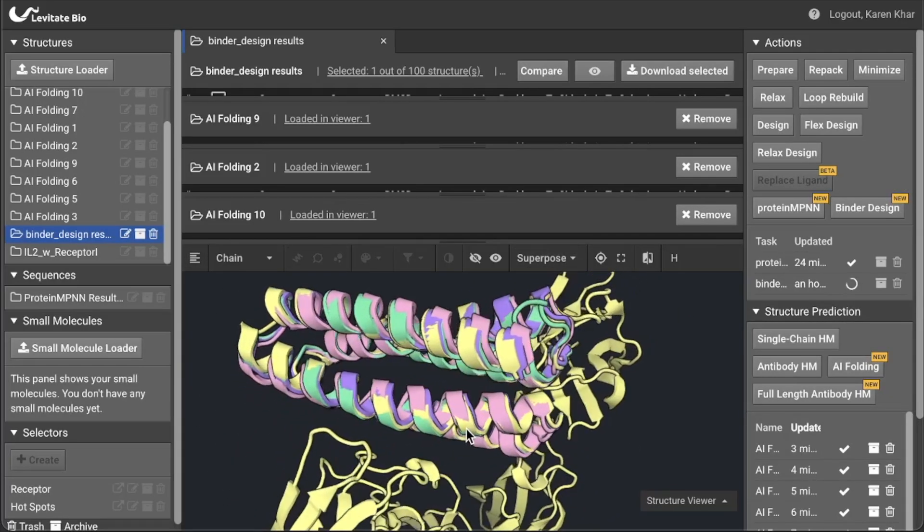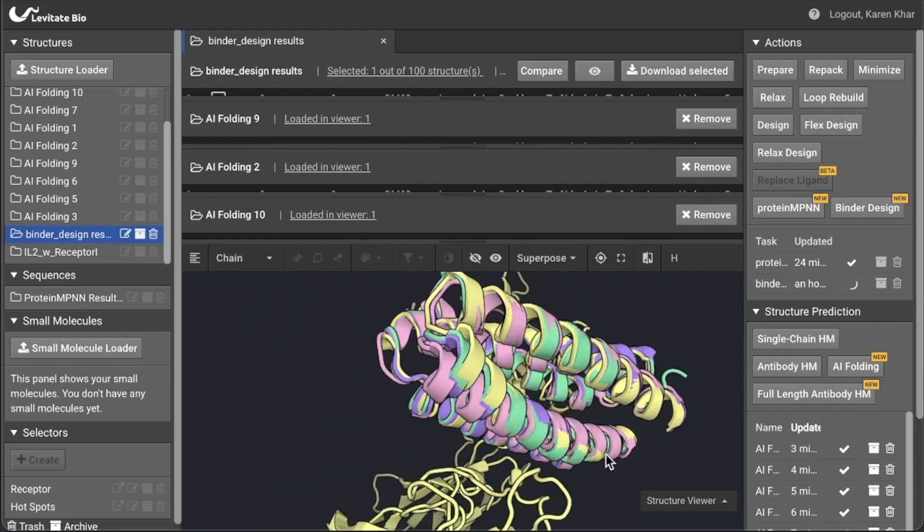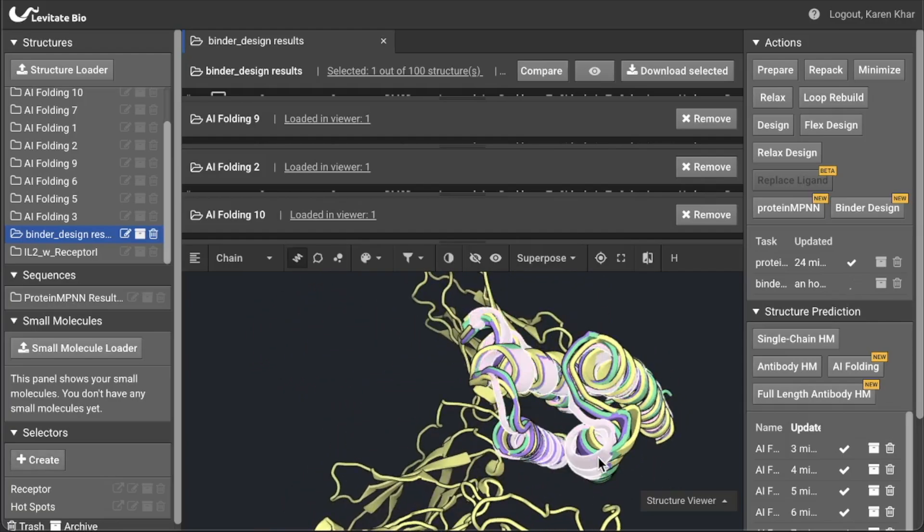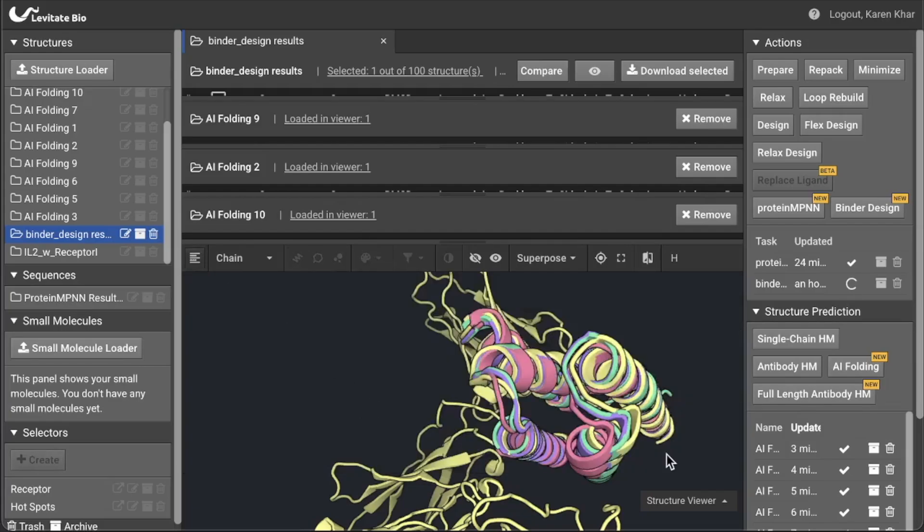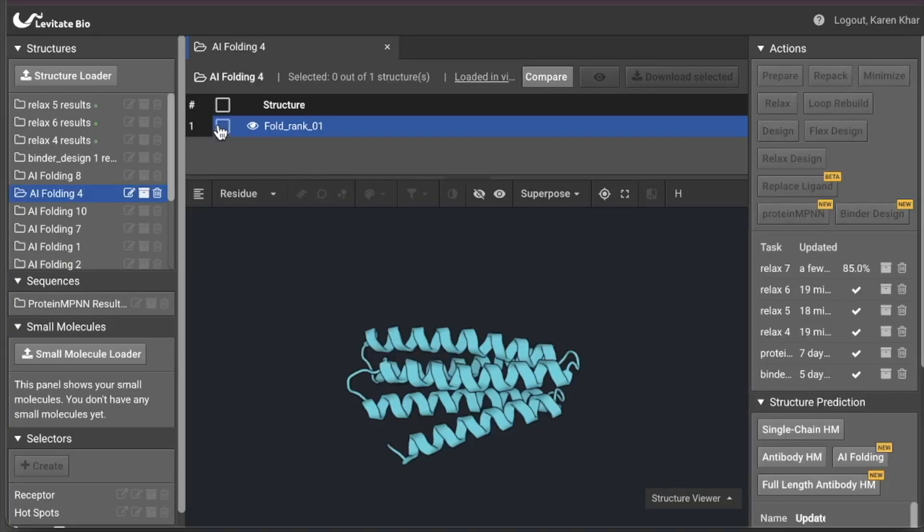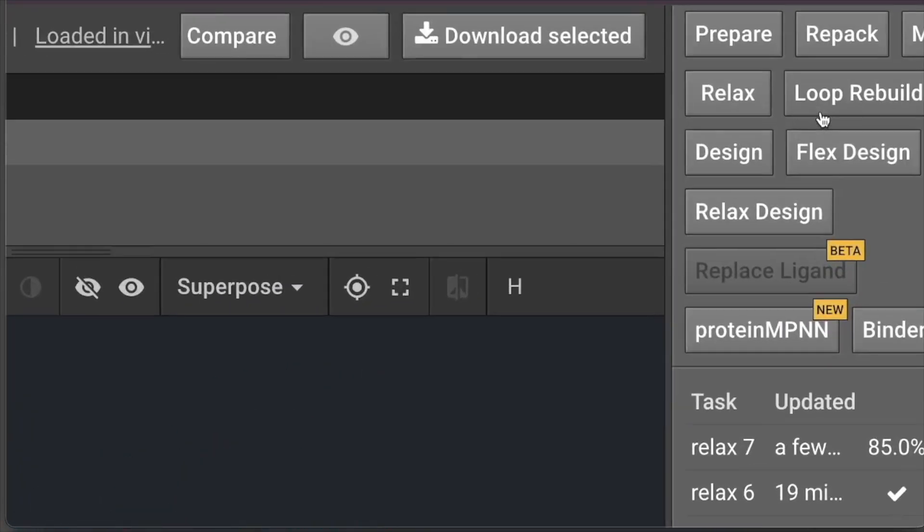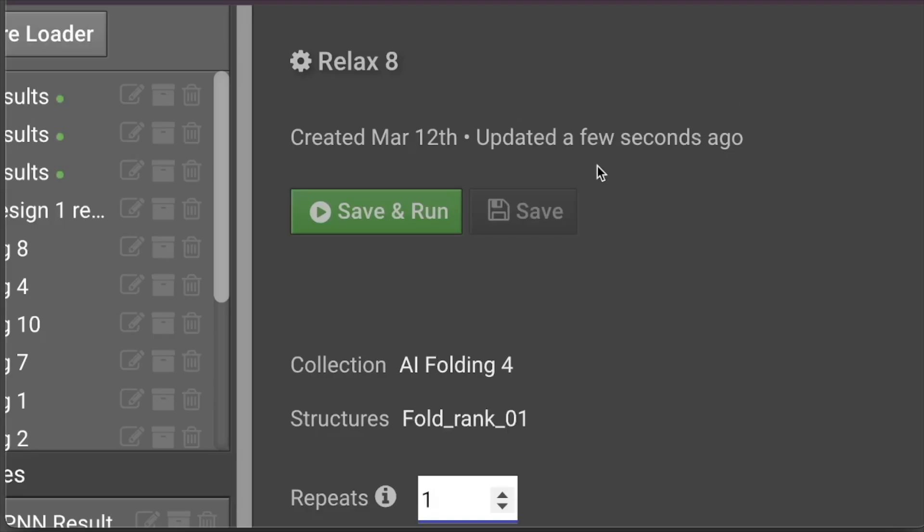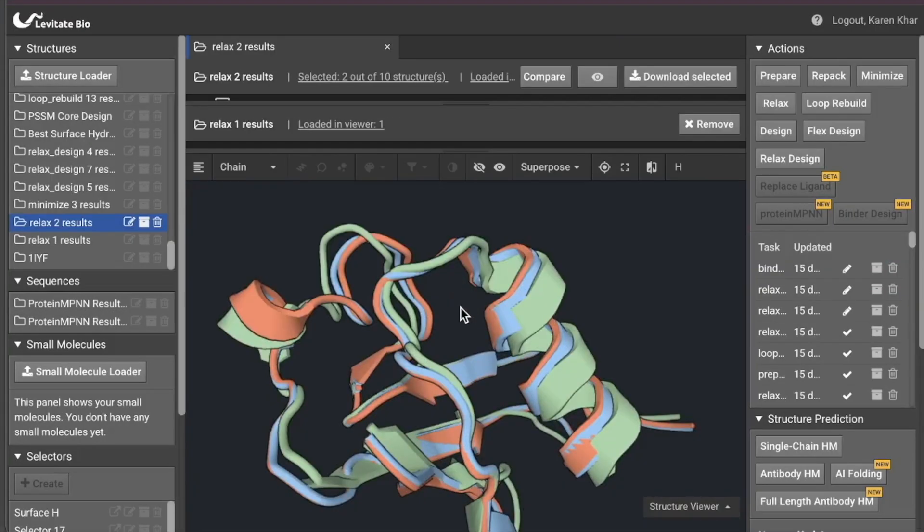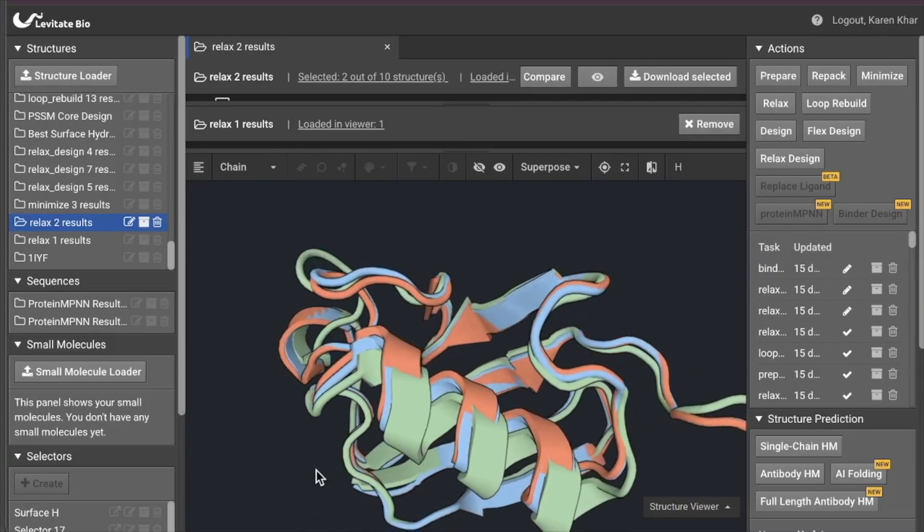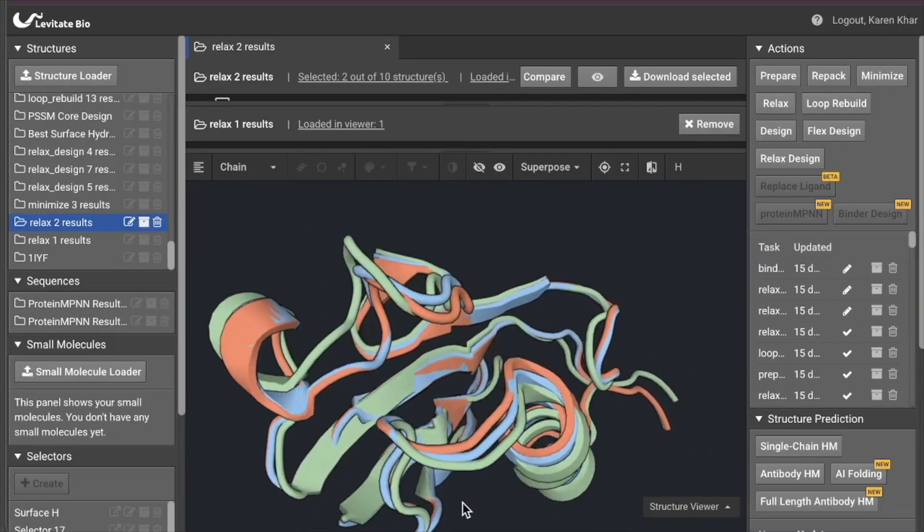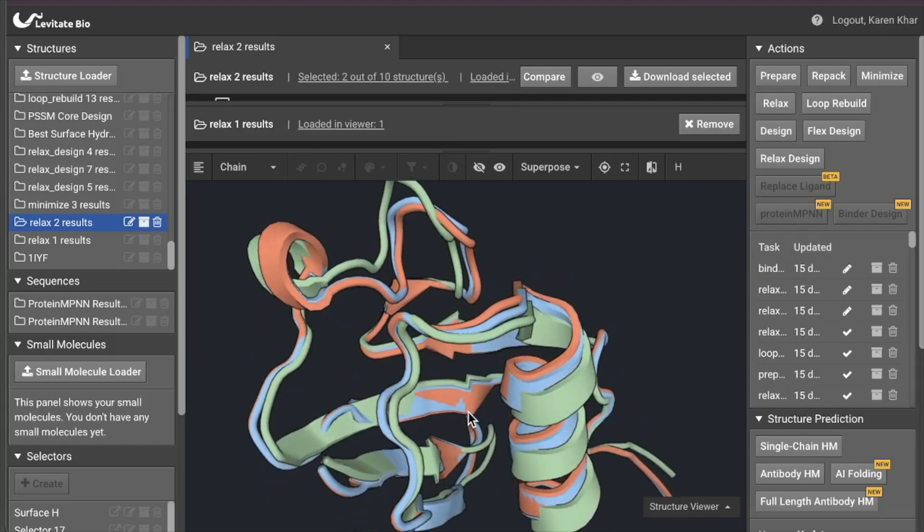Then for the hits, you can also generate a bound structure by threading the sequence onto the binder design structure using Rosetta's fixed backbone design tool. You can now run Rosetta Relax to optimize both the bound and unbound conformations. Relax is a powerful tool for understanding what dynamic conformations the protein can take and to identify the most favorable shape.